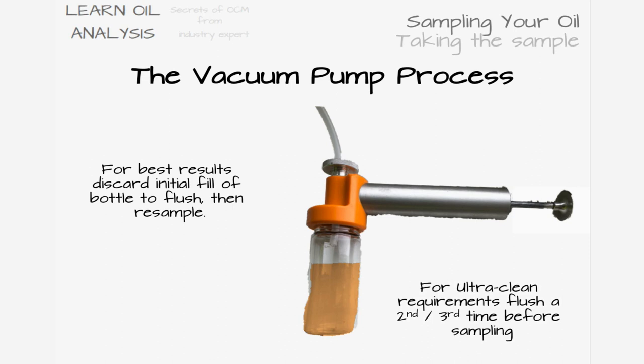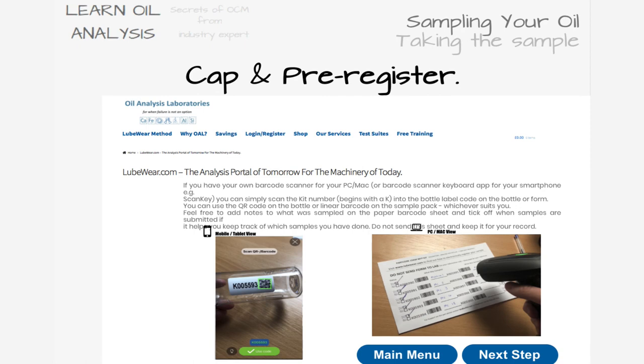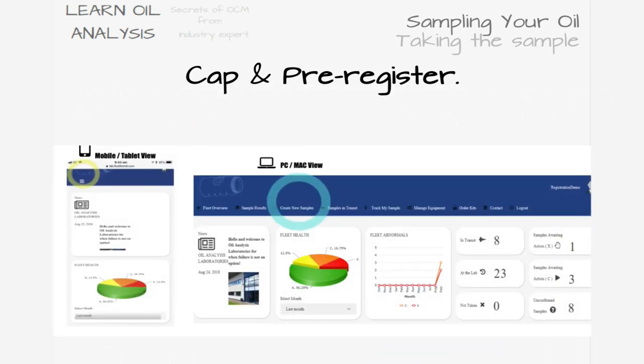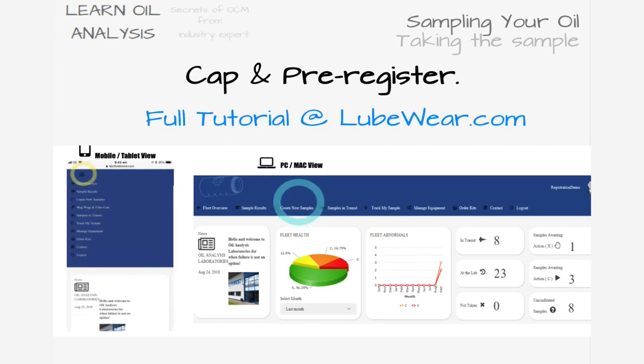As soon as you've taken the sample, unscrew the bottle from the pump and recap it to prevent contamination from the environment entering the sample. The tubing that has gone through the pump should be allowed to drain any remaining drops of oil and have a quick wipe on the bottle side before pulling out of the pump so as not to contaminate the pump. You can now post your samples — keep a note of the bottle K number so you can complete your sample submission process by visiting lubeware.com, logging in to create a sample and registering your bottle barcode.